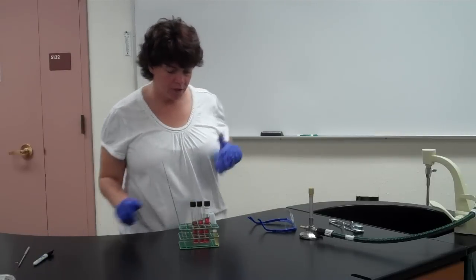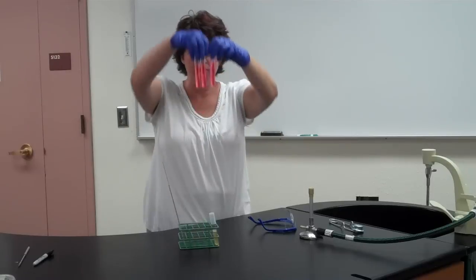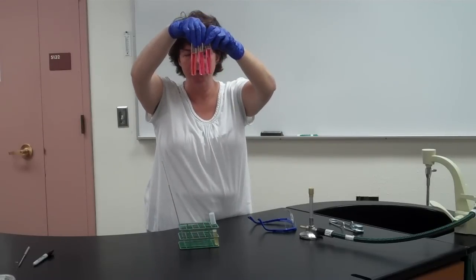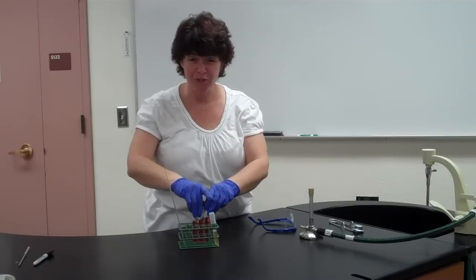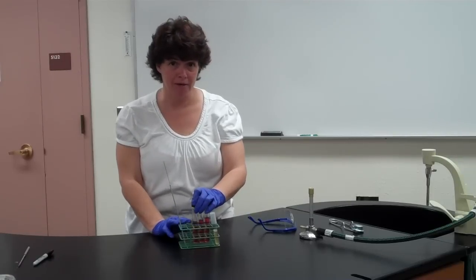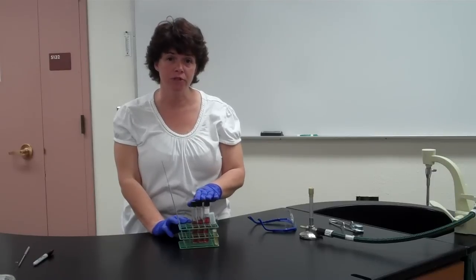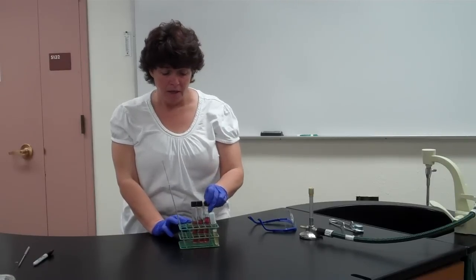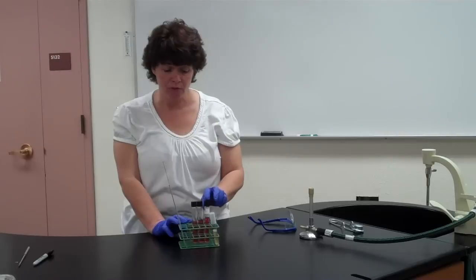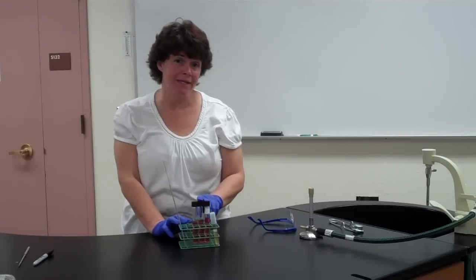Now for this particular one, we're looking at particular products. One of the things I want you to notice about all 3 of these tubes, they are red, or a form of red. This one's a little bit more orange, but they're going to be red in color. If you pick up a tube that's yellow or looks really yellowish, don't use it. That means it's contaminated. Okay, so make sure your tubes are red to begin with because we're looking for the difference of turning from red to yellow. One of the things in the media is called Phenol Red, which is an indicator of acid. So if it turns yellow, that means your bacteria produced acid. If it remains red, it did not.